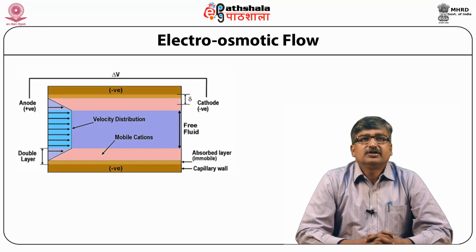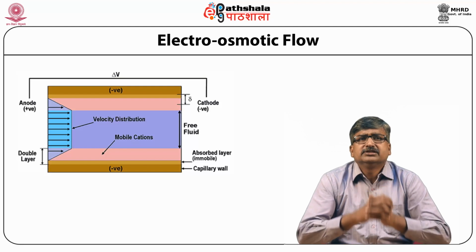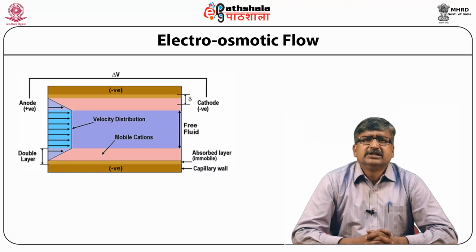Let us discuss the electroosmotic flow. A fundamental constituent of operation is electroosmotic flow, which is EOF. This electroosmotic flow is the bulk flow of liquid in the capillary and is a consequence of the surface charge on the interior capillary wall. The EOF results from the effect of the applied electric field on the solution double layer at the wall, which is seen in the figure. The EOF controls the amount of time solutes remain in the capillary by superposition of flow on the solute mobility.